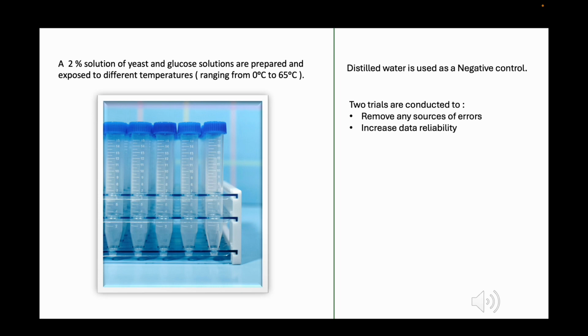Fill the tubes to the top and then invert them. Put them in a rack and set up one of the tubes in an ice bath and incubate the others at 35 degrees, 50 degrees, 65 degrees Celsius and one of them at room temperature. Next, incubate them for 1 hour to allow the fermentation process to progress, and observe them after every 15 minutes. After an hour, use graduations to determine the CO2 production.